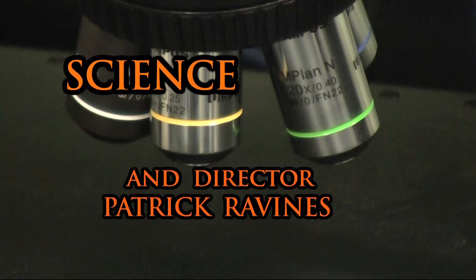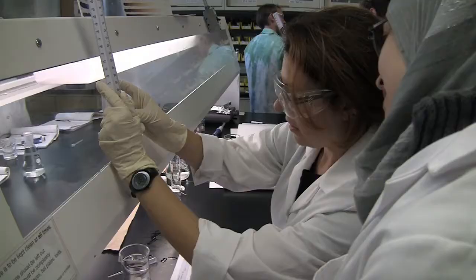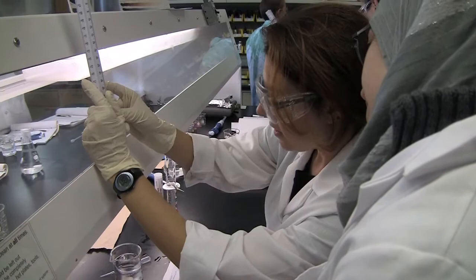This is the gist of what you will be doing all day, is measuring the height of the liquid in capillary tubes. The role of science is really to educate the students so that they understand the material nature of the cultural artifacts that they're dealing with.